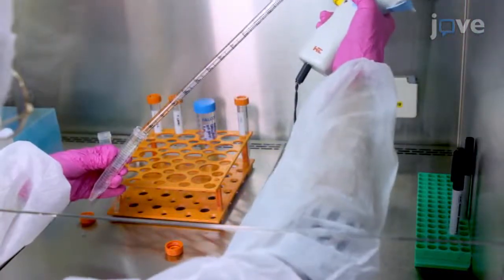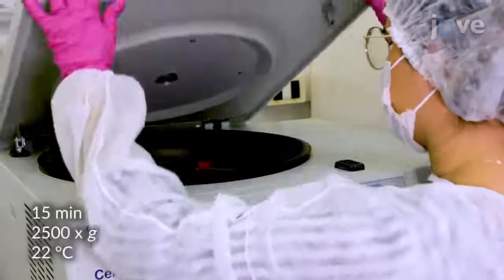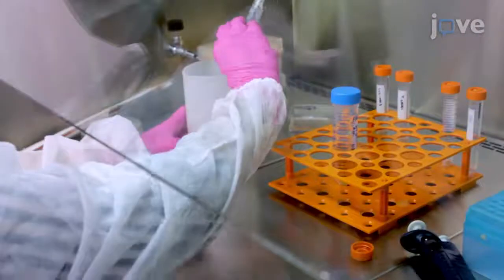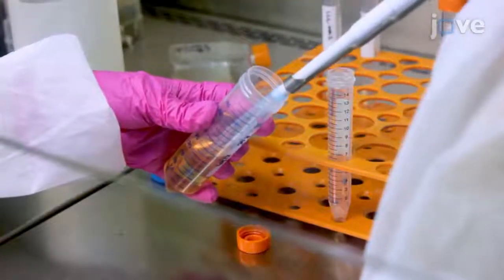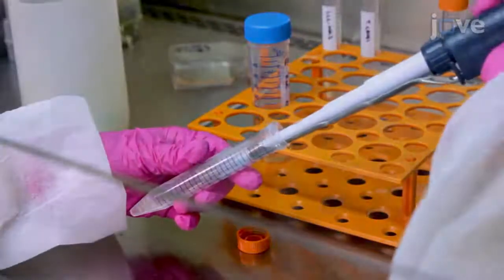collect the supernatant in a new conical tube, then centrifuge the sample and discard the supernatant, before re-suspending the pellet containing the parasites in complete RPMI medium.